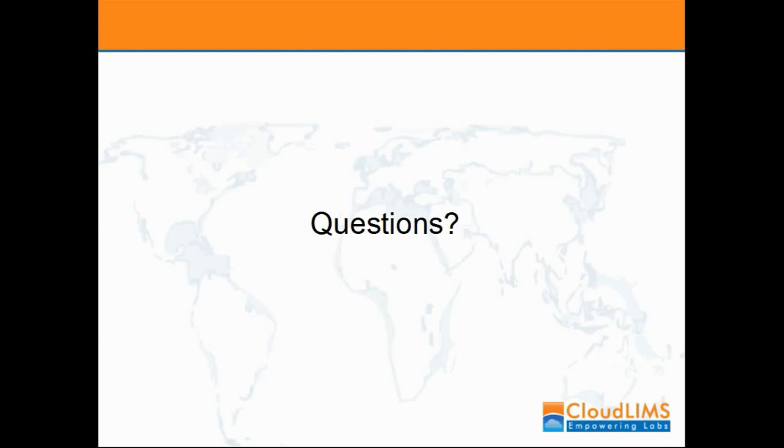All right. So to answer this question, let's put a picture together where we are coupling a cloud-based SaaS with LIMS and how it benefits immensely. Now, cloud is nothing but a virtual space that enables users across the globe to store and access their shared pool of data, resources, and programs. Now, these are otherwise stored on a computer hard drive. Cloud uses a network layered approach to connect users' computers to resources centralized in a data center.